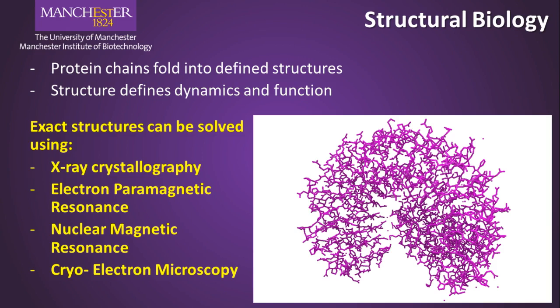Other techniques, such as nuclear magnetic resonance and electron paramagnetic resonance, work via the application of a magnetic field to a protein sample and analyzing the way this field is distorted by the sample. This is the same principle that is applied to body scanning equipment in the field of medicine, but on a much smaller scale. Samples of protein can also be frozen and analyzed under very powerful cryo-electron microscopes, which detect electrons reflecting from the sample rather than light, unlike the way optical microscopes work.